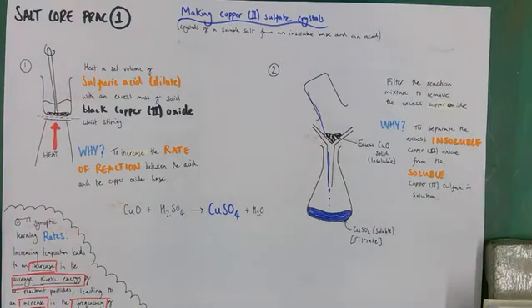Stage one: get your dilute sulfuric acid, because we're making a sulfate. Add a set volume into a beaker, then add an excess mass of black copper(II) oxide base and stir. This ensures the reaction goes to completion.